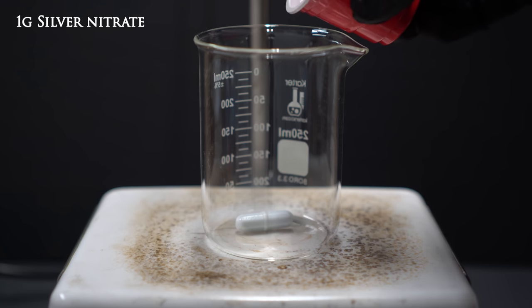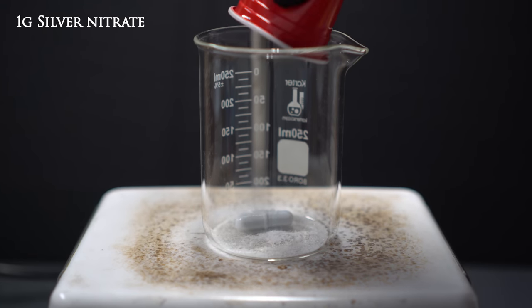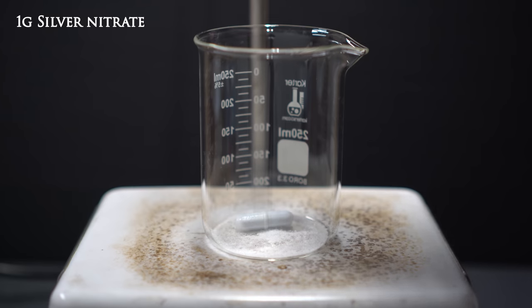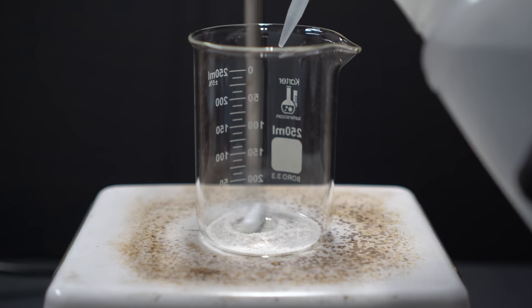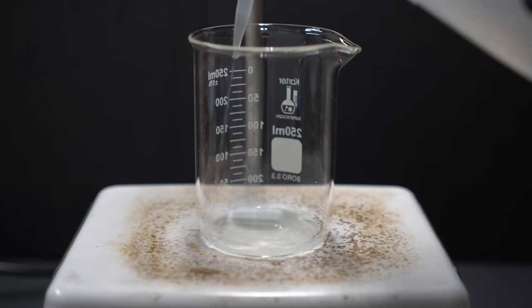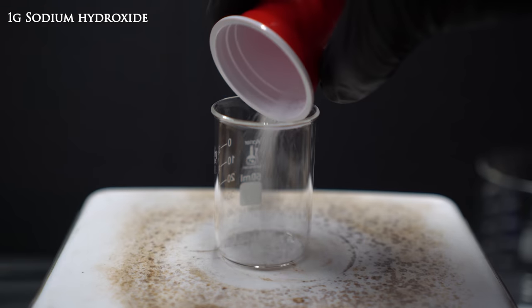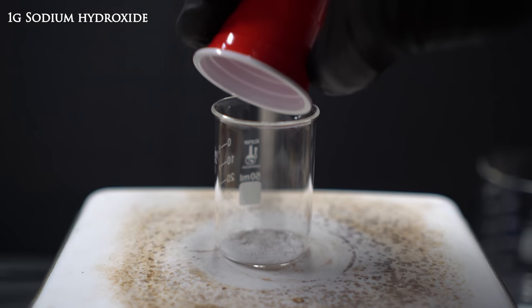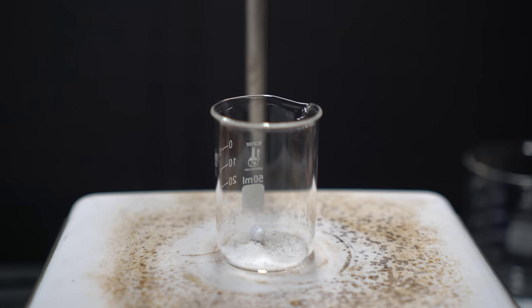It's now time to make that mirror. I decided to use Nerd Rage's silver mirror procedure. To a beaker we're going to add one gram of silver nitrate, turn on stirring, and add just enough water to fully dissolve it — being careful not to add too much water as it will decrease the molarity. To another beaker we're going to add one gram of sodium hydroxide.